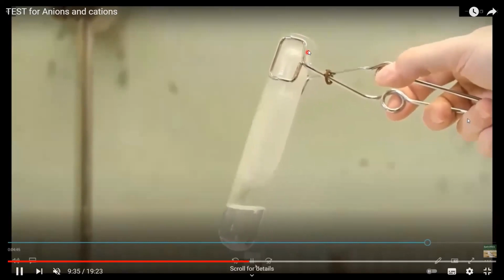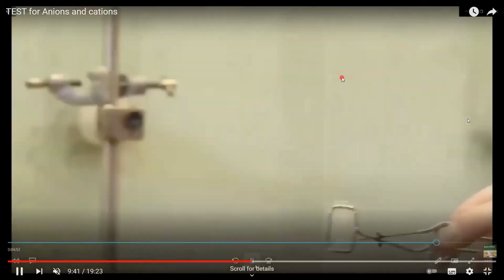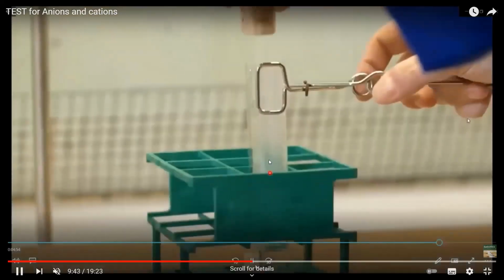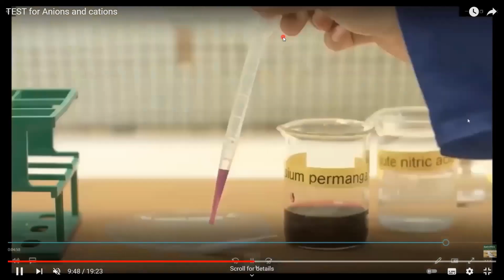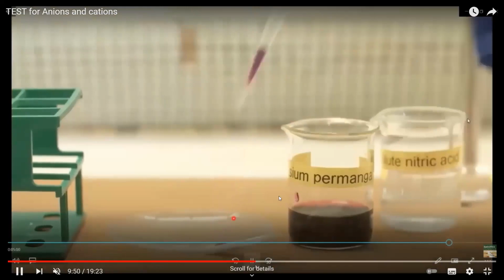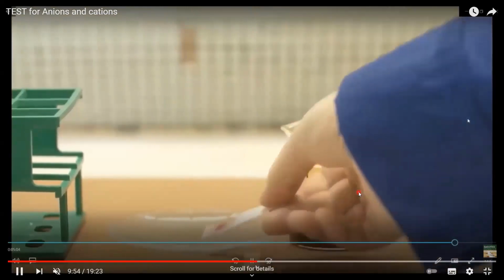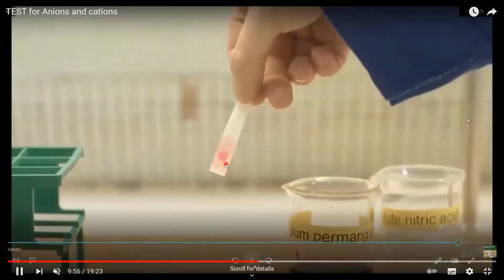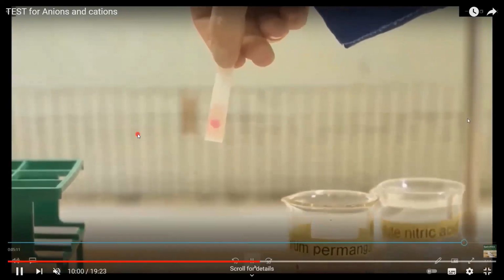The gas, which is sulfur dioxide, when passed through a purple solution of potassium manganate, as you can see, we place a bung here just to trap the gas. Either we can pass the gas, or potassium manganate can be added to a paper and placed near the mouth of the test tube.